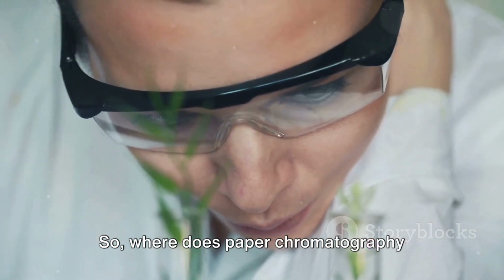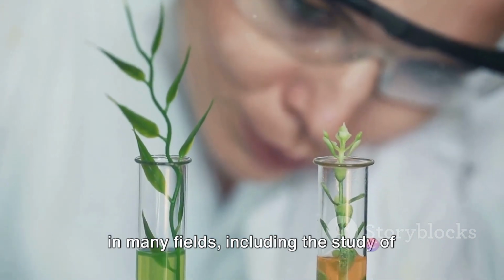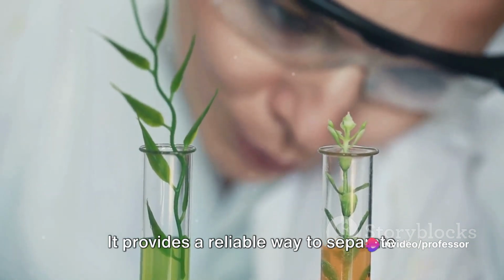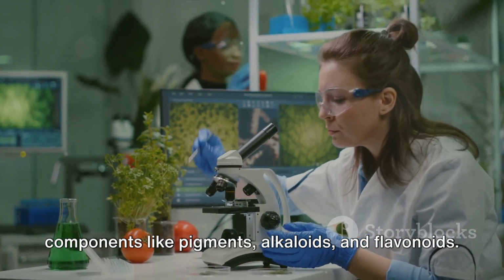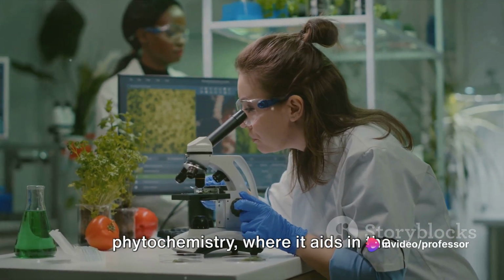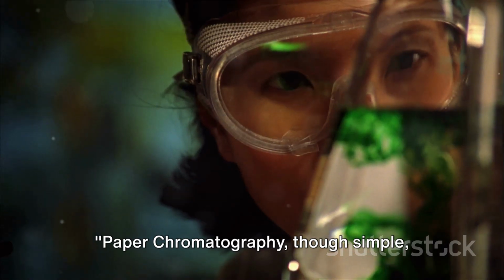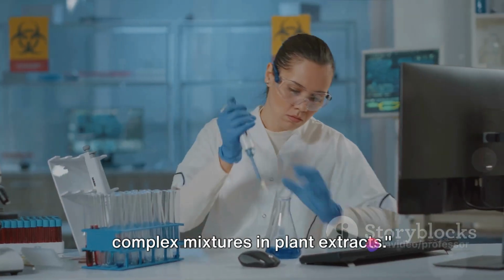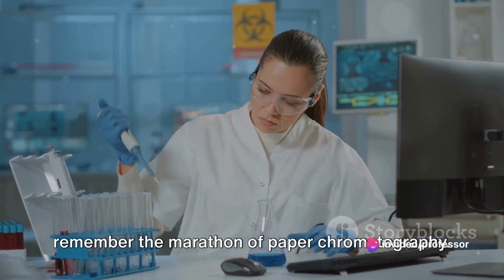So, where does paper chromatography shine? Its simplicity and cost-effectiveness make it a go-to method in many fields, including the study of plant-derived products. It provides a reliable way to separate complex mixtures in plant extracts, helping us identify and quantify various components like pigments, alkaloids, and flavonoids. It's a key player in fields like phytochemistry, where it aids in the identification and analysis of plant metabolites. Paper chromatography, though simple, provides a reliable method for separating complex mixtures in plant extracts. So, next time you think of separation, remember the marathon of paper chromatography.